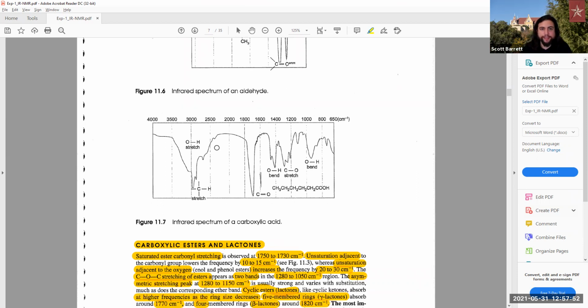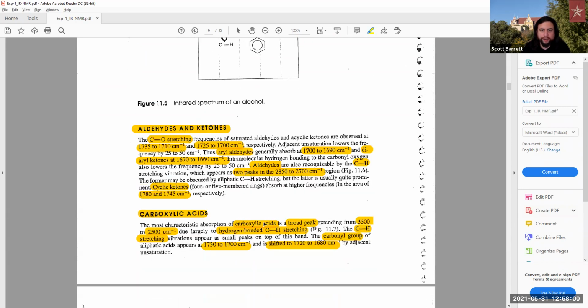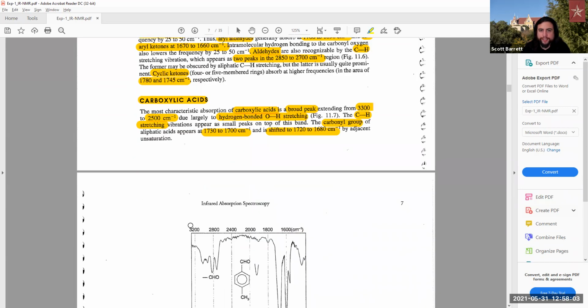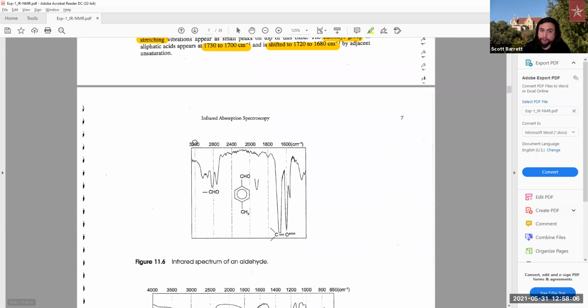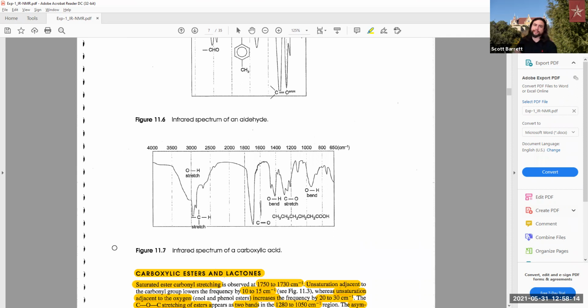So in this instance, this is an infrared spectrum of the aldehydes. You can see some characteristic peaks here from the aldehyde we were speaking of with regards to the two peaks in this region. They're not broad like the alcohol, but there are some characteristic peaks. Then you have your carbonyl peak here in this 1700 region. Then here's our carboxylic acid now, right? So the carboxylic acid has our deep oxygen-hydrogen stretch, and we also see our carbon stretch here. It adds into the broadness of it. And then the carbonyl peak, very strong and deep here at the 1700 region.